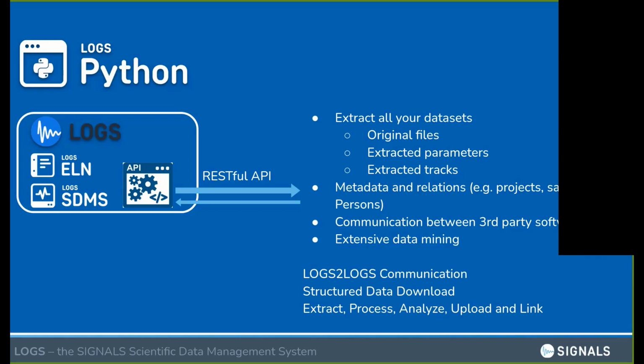And you can use this programmatic interface to connect LOGS with third-party software, for example, analysis tools that you are used to in your lab. And you can do, if you want, extensive data mining, of course, because you have all the data in a structured manner in LOGS. And you have also additional information, metadata, that you can extract and use for data mining if you have a lot of data and you want to understand properties of the whole thing. And as you might know, if you worked on data mining projects before, it is really necessary or really useful to have metadata and structured information. The better your data is organized, the better data mining you can do.